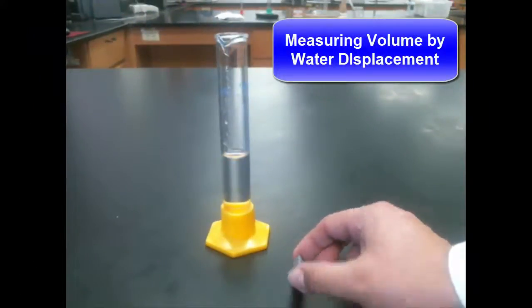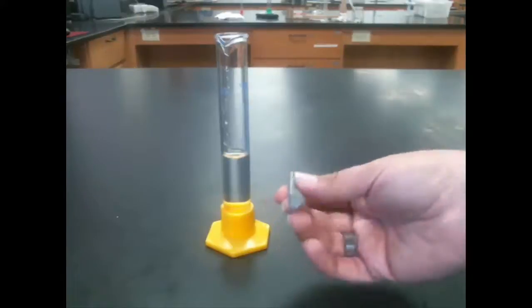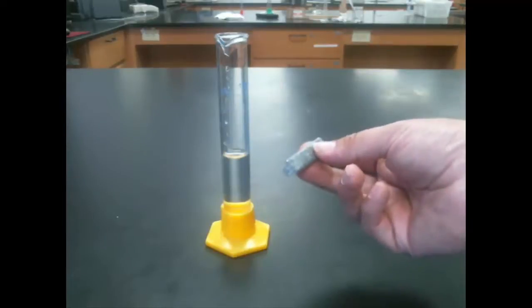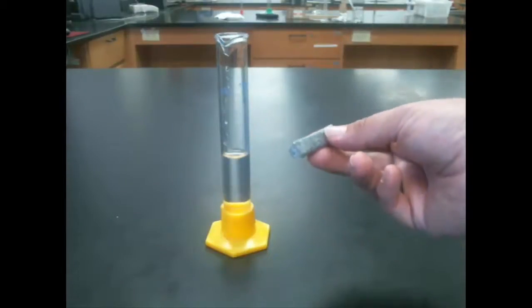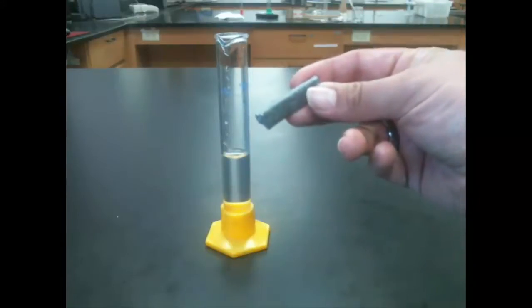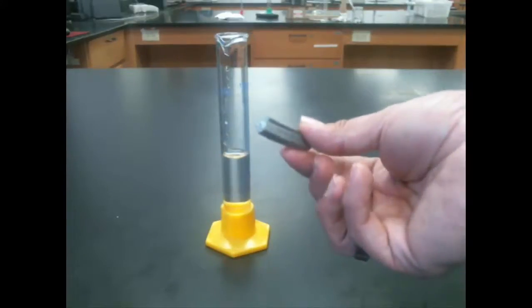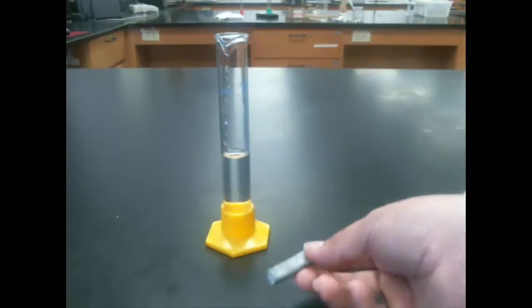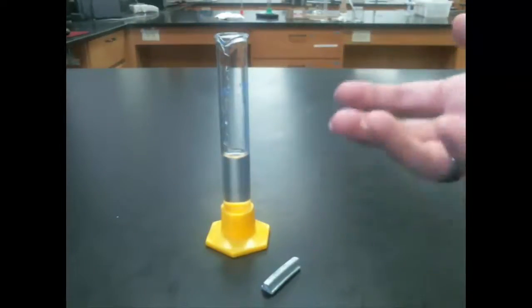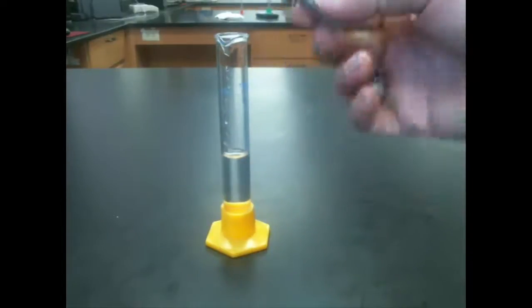Let's say that you want to measure the volume of something that has an irregular shape like this. You can't actually calculate the volume doing length, width, area of the base, height, all that stuff, because this is irregularly shaped. It's really hard to do. So we can figure out its volume by using a method called water displacement. Water displacement is a phenomenon that happens when you take something and submerge it in water. The water displaces an equivalent volume to the object that was placed in it. This is why when you sit in a bathtub, the water rises when you get in, because the water is being displaced by you. So we're going to use that very idea to find the volume of this irregularly shaped metallic bar.